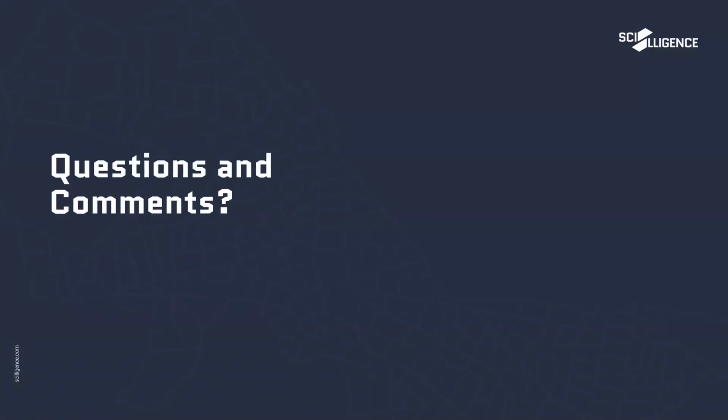Thank you, Alan. We do have a question in the chat box. The question is, is FOCUS web-based or is it a desktop package? That's a great question. Yes, it is a web-based tool. It is not desktop. It is web-based, and it's designed to integrate with our own Regmol module. And as you see, also inventory.